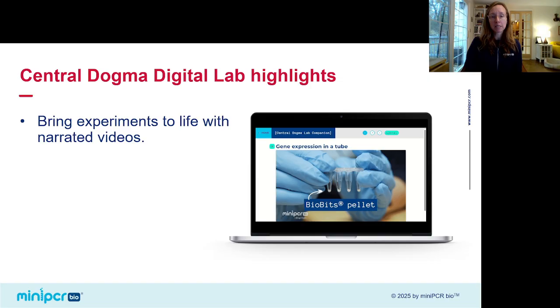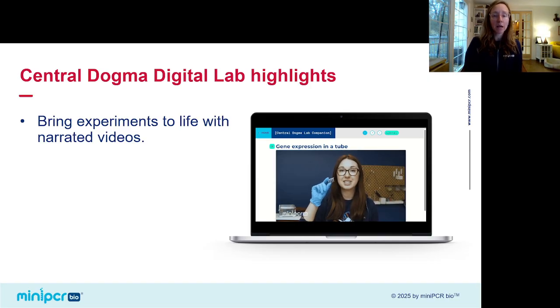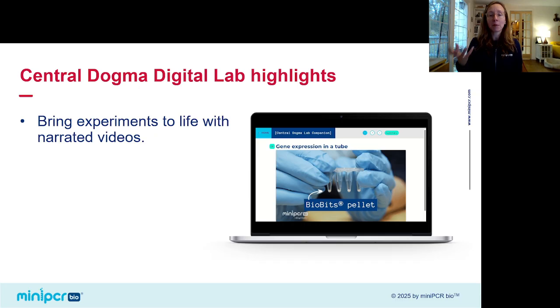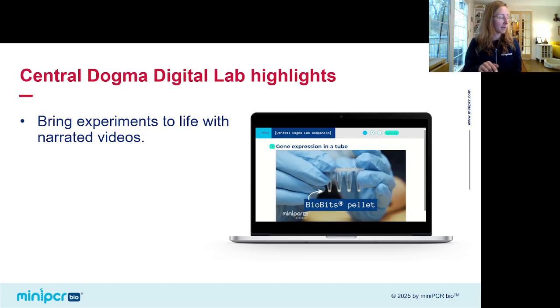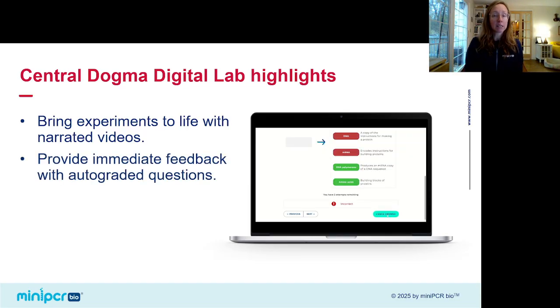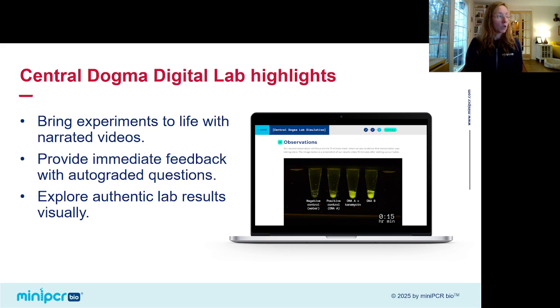All of our digital labs include narrated videos hosted by a friendly scientist that bring experiments to life and walk students through what is happening molecularly at each step of our experiment. There are auto-graded assessment questions on virtually every screen, so students get immediate feedback constantly about their understanding. And all of our digital labs include authentic lab results. So even if students who are doing the hands-on lab make an error and don't get the expected results, they can still refer to these videos and photos of the expected results and walk through interpretation.